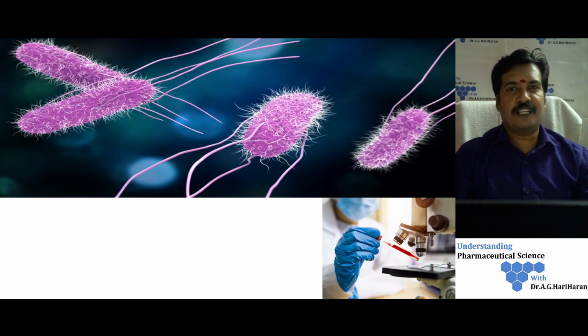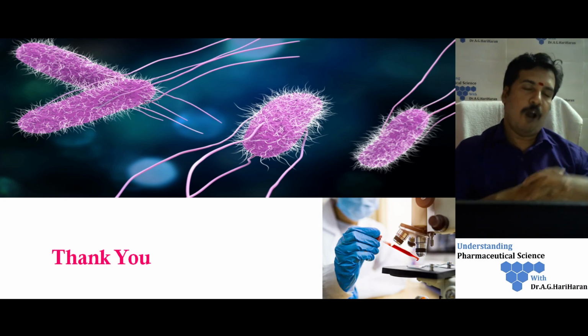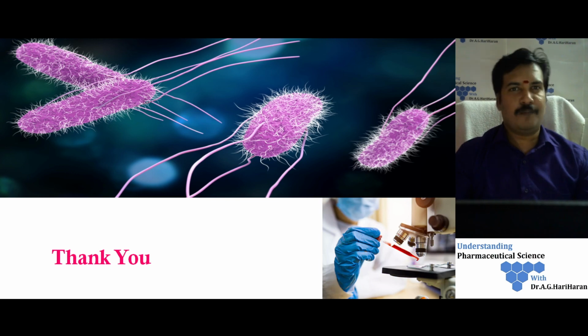I think this lecture will be very helpful for you for understanding the basic outline about the different methods that have been used for the cell counting technique, that is the enumeration of a microorganism or a bacteria.